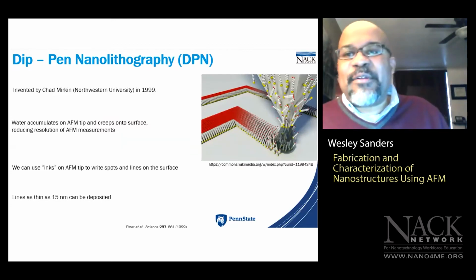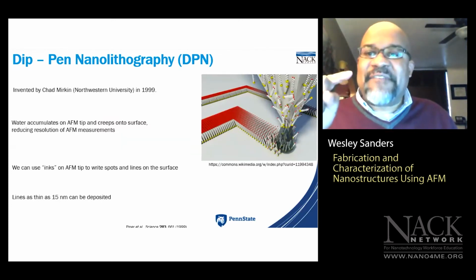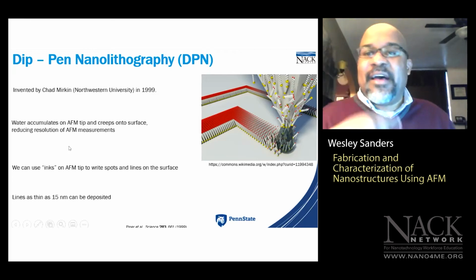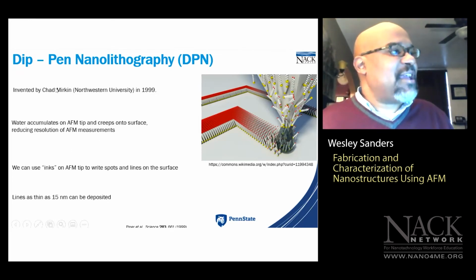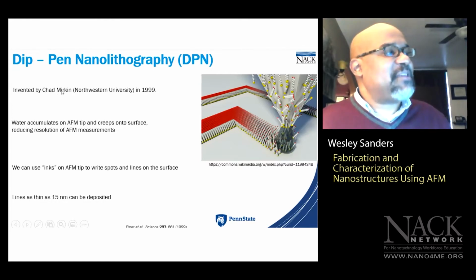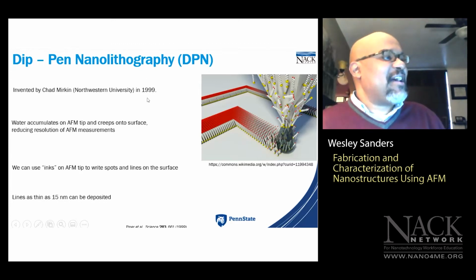So with dip pen nanolithography, we're actually using the AFM tip as an ink pen. This is a very clever method of lithography that was invented by Chad Mirkin. He's a very famous chemist, teaches at Northwestern University. This is a technique that was invented by him in 1999.